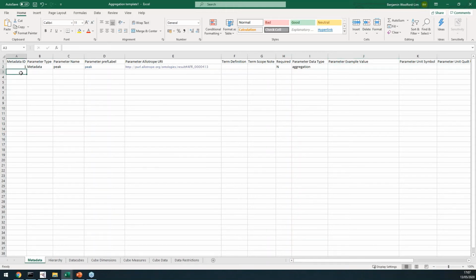So we've defined our first field, a peak. Not very interesting, not really a lot to go on there. So let's go with the next one. Let's jump to row 2, add some more metadata. Peaks tend to have, I think, retention times are probably pretty useful.